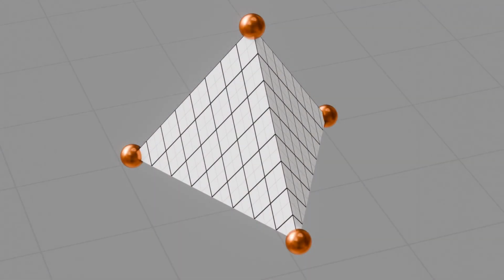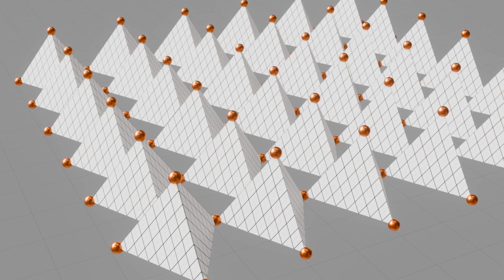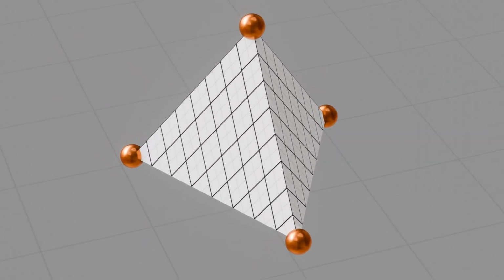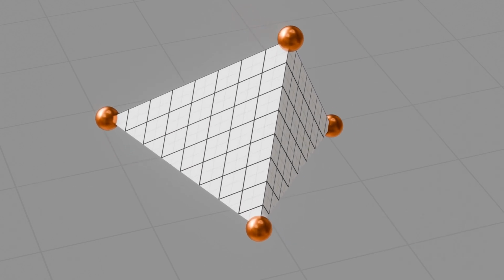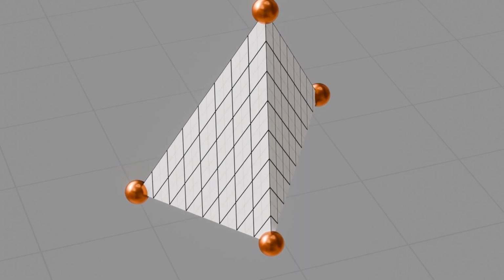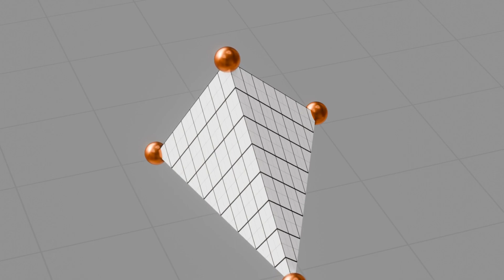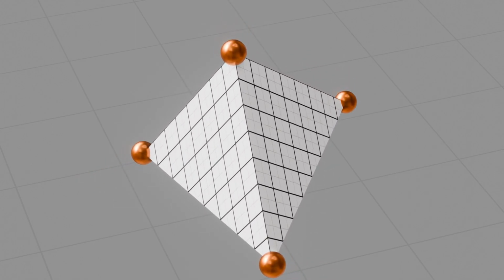And these meshes are a set of tetrahedrons that tile the entire three-dimensional space that our volume occupies, okay? And when we instead model the deformation of these tetrahedra, we are only moving 4 points around, right? There's 1, 2, 3, 4 points for every tetrahedron. And when we move those points, we scale all of the volume density that's in that tetrahedron linearly. And so that means that just by modeling 4 points, we can actually move density around between a significant number of voxels.